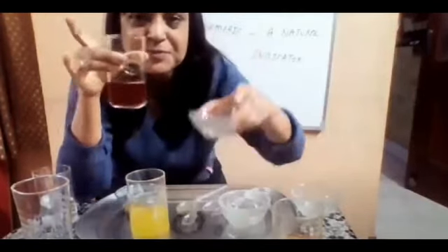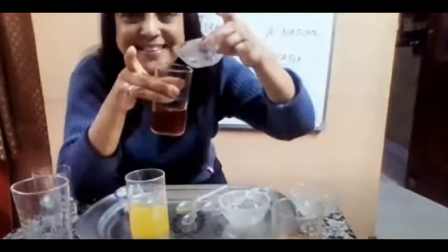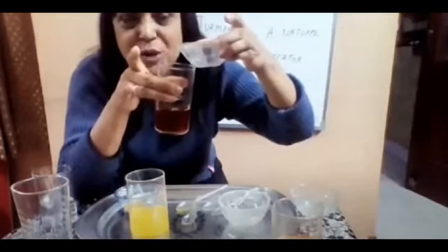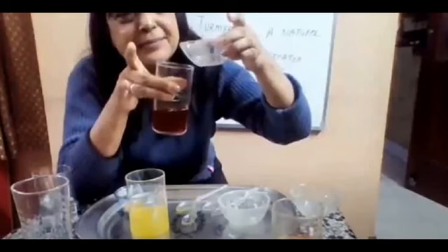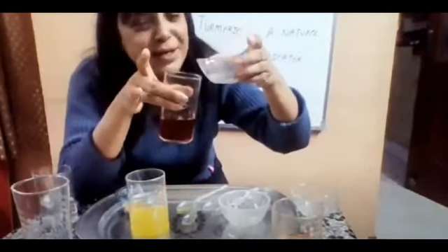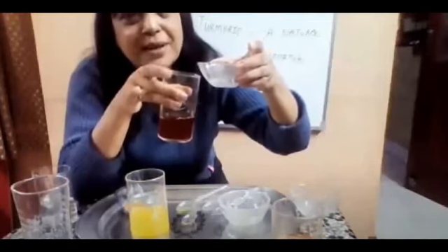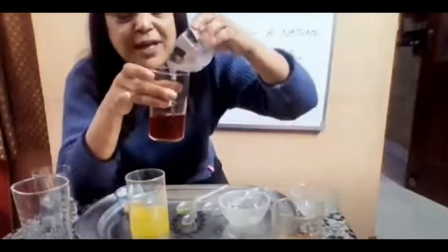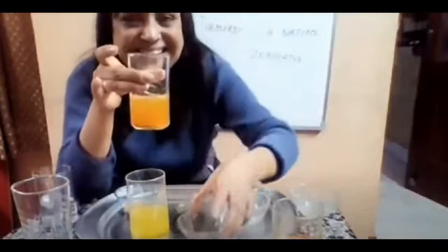Yes, ma'am. It's a red color. What should I do? Should I add vinegar into it? Yes, ma'am. What will happen? Anyone before adding? What is going to be the change? Bhavi? Ma'am, color gets changed to colorless? No. Your indicator turmeric is yellow, not colorless. It will come back to its original yellow color. Has it come?